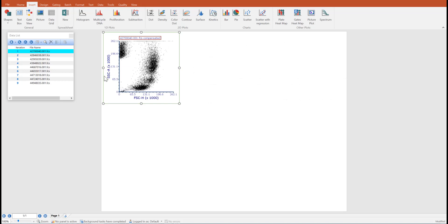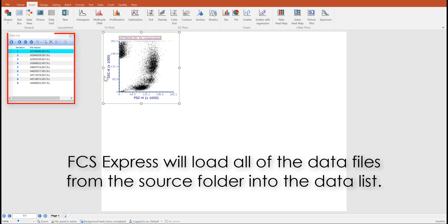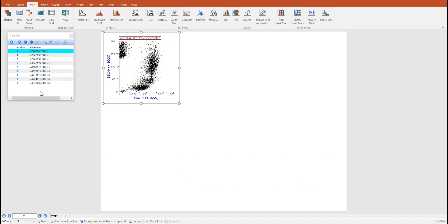When the first plot is inserted into FCS Express, FCS Express will automatically load all of the data files from the source folder into the data list.